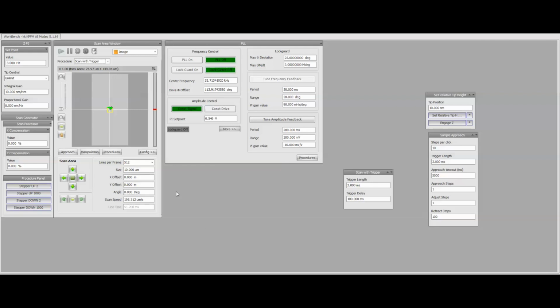So that's all you have to do in order to add a TTL trigger pulse at 5 volts from the DAC1 after the image pixel is sampled in a pixel-by-pixel scan mode.